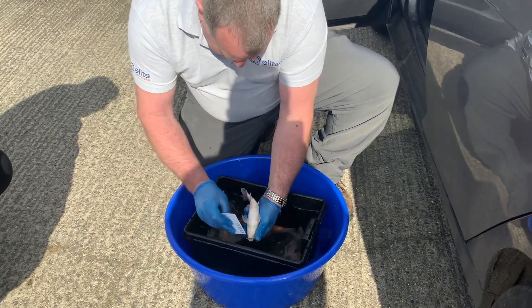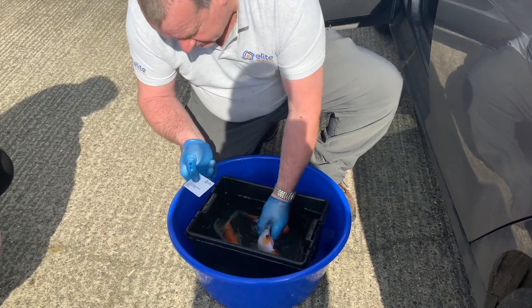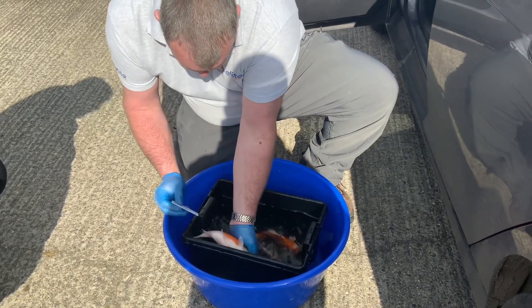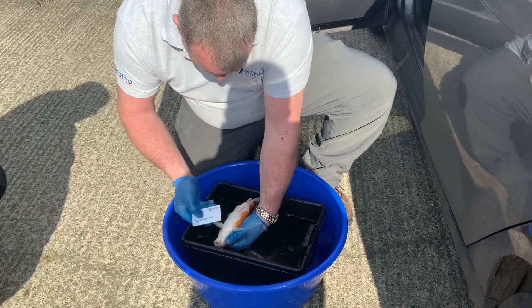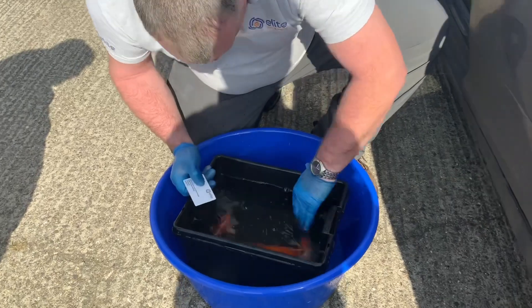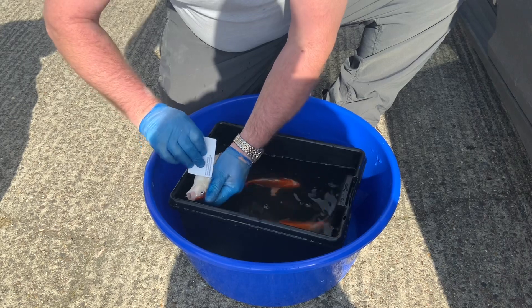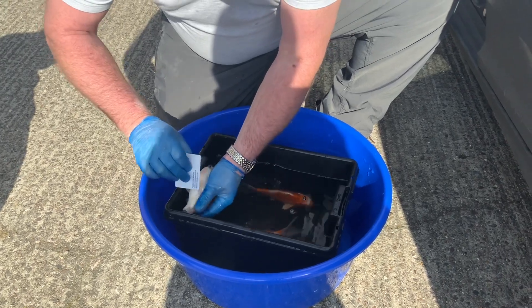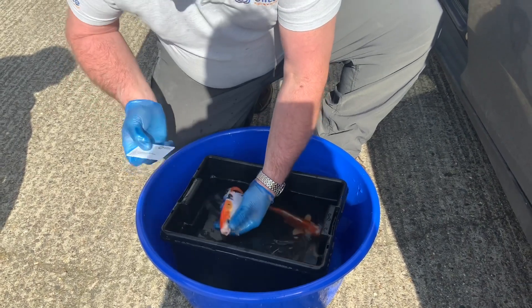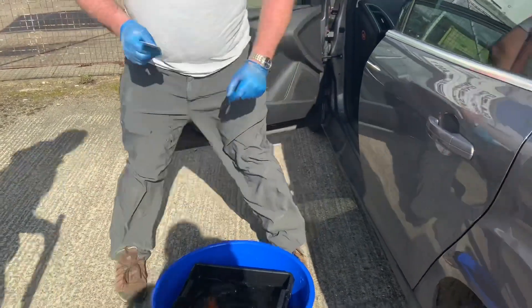To take a scrape, take the card and scrape from the head towards the belly, just applying enough force to collect mucus from the side. I'm going to take scrape mucus from all three koi. You can see that mucus there on the side. Always good to scrape around the pec fins, around the gill area, and around the anal fin. If you're struggling to get mucus, you can always take a bit from the head.